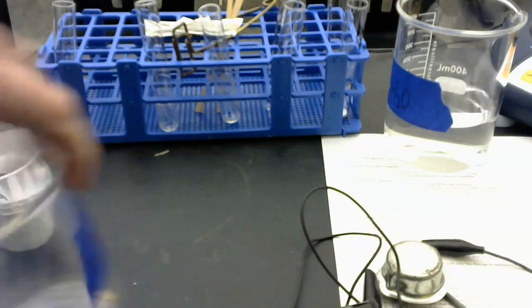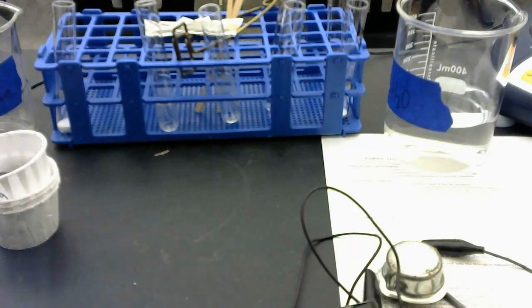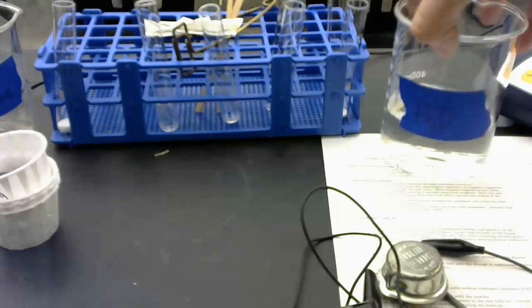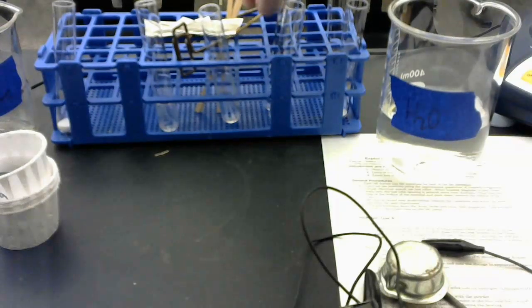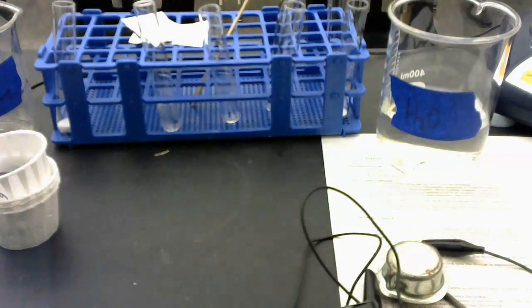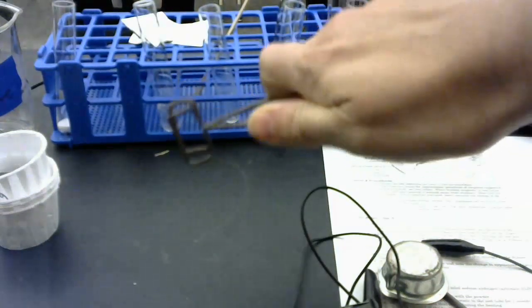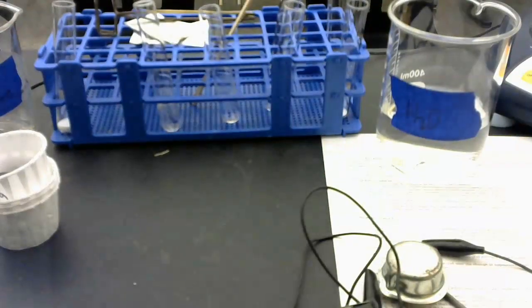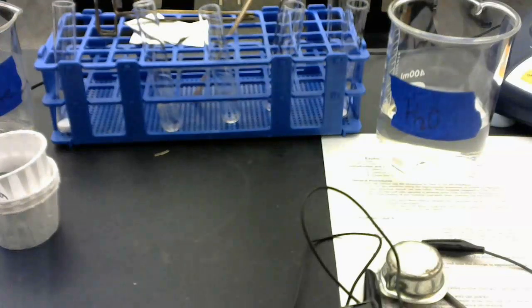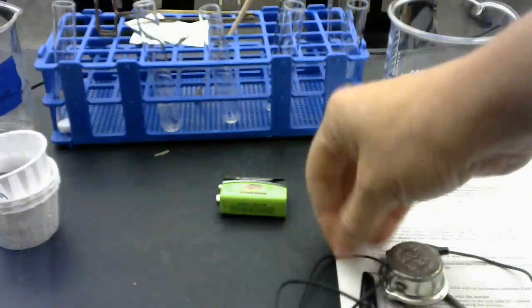You're also going to have a waste container that I'm going to put aside. And that's going to be for all of your waste throughout the experiment. You're going to have a beaker filled with water. You're going to have some test tube clamps. You're going to have a test tube clamp, which is this right here, and that's going to be used to hold your test tube when you're heating it. You're going to have 2 strips of aluminum foil, some wood splints right here, and then you're going to have a battery, some alligator clips.